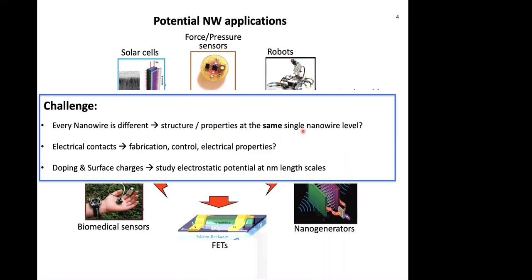For all these device applications, we also need electrical contacts to the nanowires, and therefore it's very important that we can fabricate and control high-quality electrical contacts.